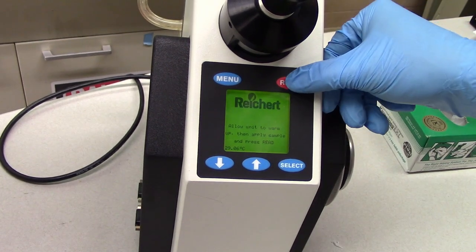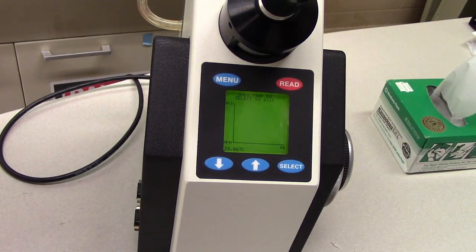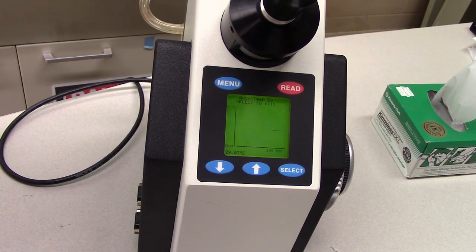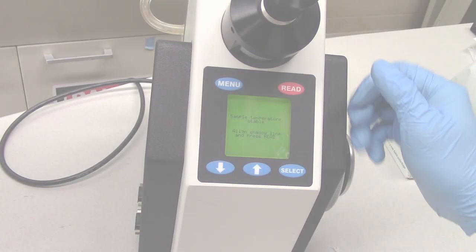Press the Read button and wait for the refractometer to determine that the sample temperature is stable. When prompted, double-check that the border is still aligned with the crosshair, then press Read.